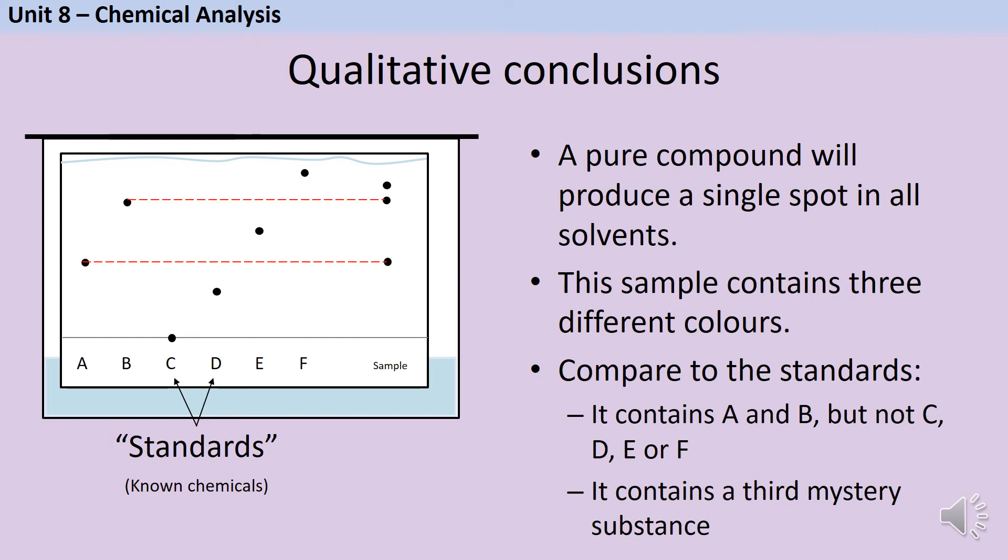Then I'm going to compare those three dots to the standards. So you can see that I have one dot at the same height as the dot for A, and that tells me that my sample probably contains substance A. And then I have another dot at the same height as substance B. So my sample contains substance B.